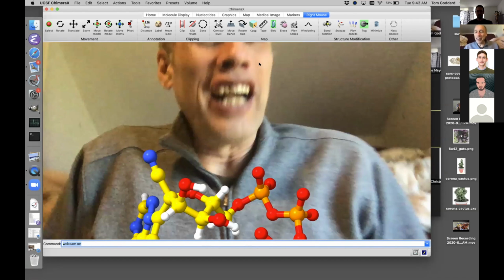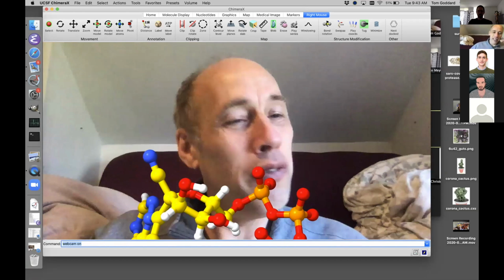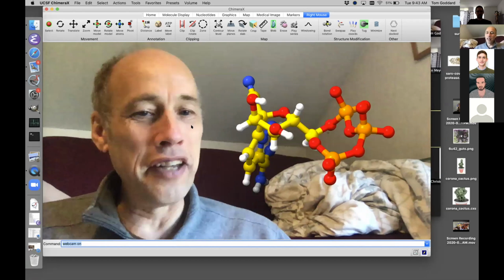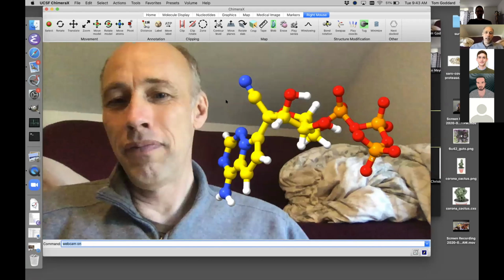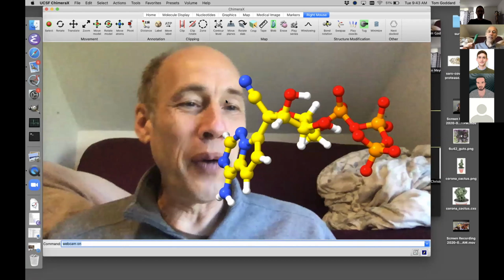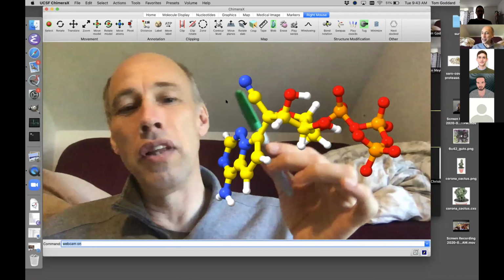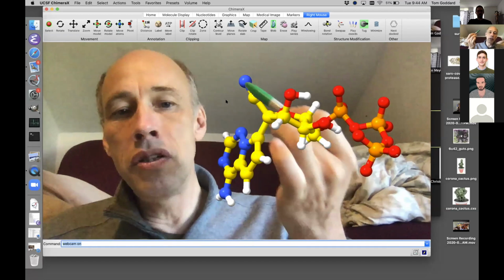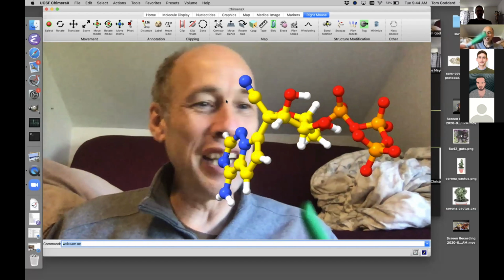Excellent question. You may think, yeah, that was pretty brutal, me spinning a molecule in front of my face. When I've made videos, what I normally do is I'm off to the side, and I put my molecule over here, and I don't obstruct my face because that's pretty horrible. But when I tested this laptop version, what I found was I could do it that way. I mean, it doesn't require anything special. What I found was my eyes didn't look like they were looking at the molecule. When I tested this yesterday, I'd say, do you see this nitrogen is the key nitrogen and this carbon? These two are what obstruct the RNA polymerase. Well, it doesn't look like I'm looking at the molecule. Because of just the alignment of the webcam.